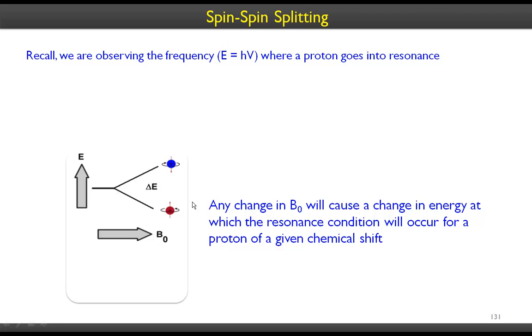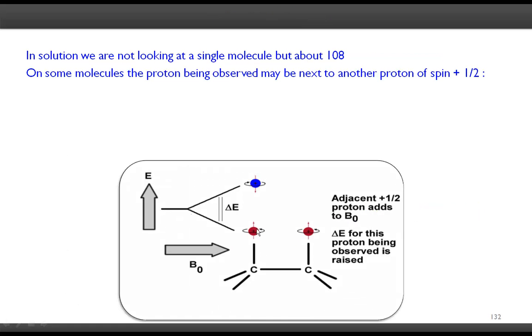So we don't have any nuclei here, right? Let's take a case where this hydrogen has a carbon, and this carbon has a neighboring carbon that in turn has a hydrogen, and we are looking at neighboring hydrogens, neighboring nuclei. We are not taking into consideration the field of this carbon. We are only looking at the hydrogens in hydrogen NMR for the reasons that we already saw.